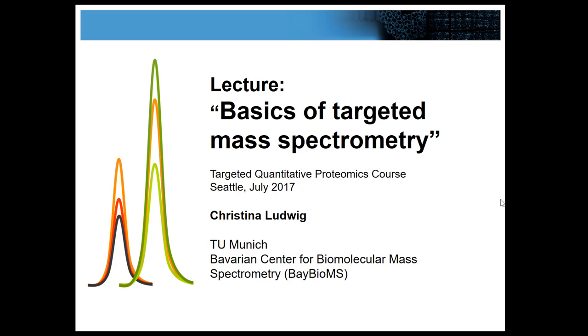Okay, so the aim of my basic lecture here on Monday morning is to introduce you to the most important basic concepts and principles of targeted mass spectrometry. And giving this first intro lecture of the course on Monday morning is always a bit of an unthankful task, because I think you're a very heterogeneous crowd of people here with very different experience levels. So for those of you who are already very experienced in doing targeted proteomics and in particular doing SRM, what I will tell you in this next hour is probably just a wrap-up of things that you already know. So I apologize already to those people.